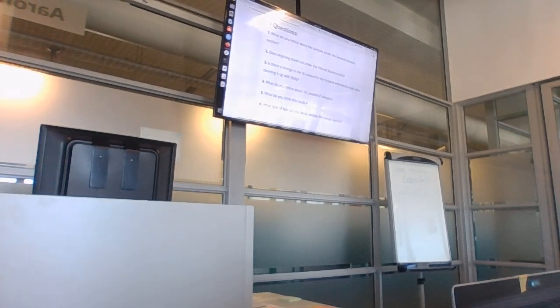Okay. Okay, in your case, yeah. Because it doesn't matter. In some way, okay, this is the worst example. But normally if you do variant calling or what you did, you select... When you did the FastQC, did you select the JSON file?